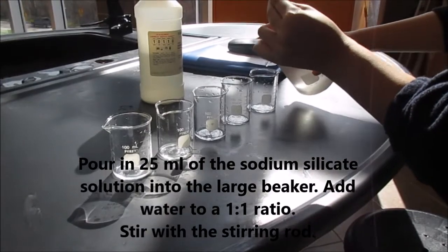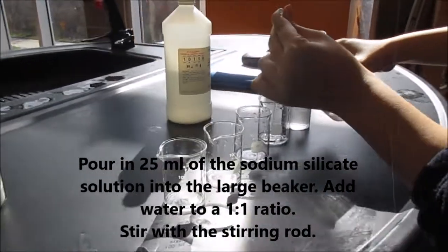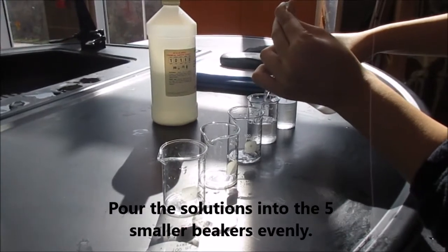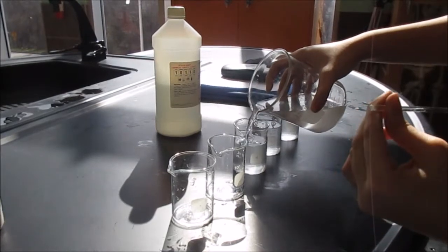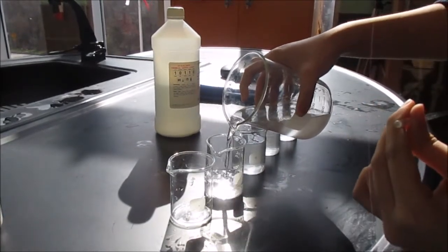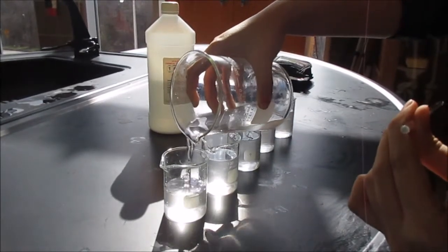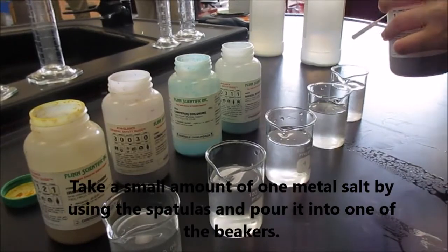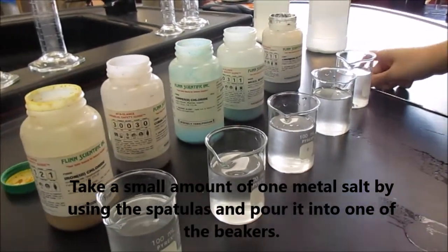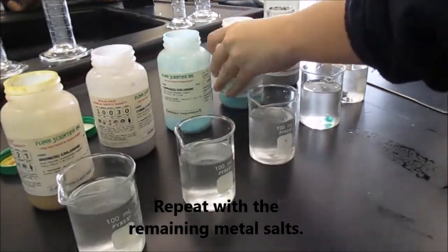First we poured the sodium silicate solution into a large beaker and added water to make it a 1 to 1 ratio. Then we stirred with a stirring rod. We then poured the solution into five smaller beakers evenly. We measured a small amount of metal salt and poured it into one of the beakers. We then did the same step to the remaining metal salts.